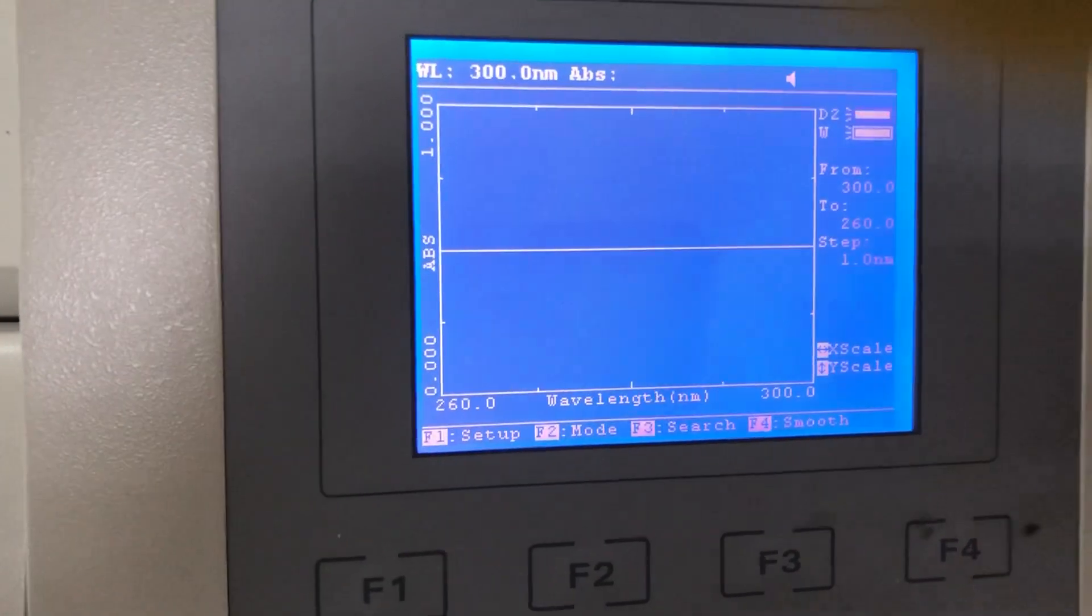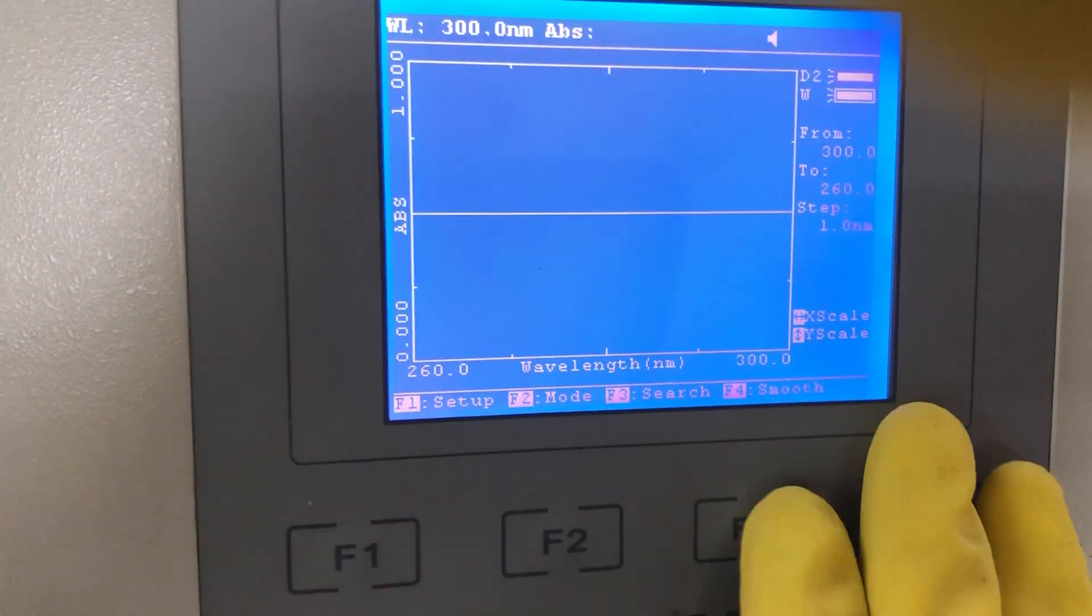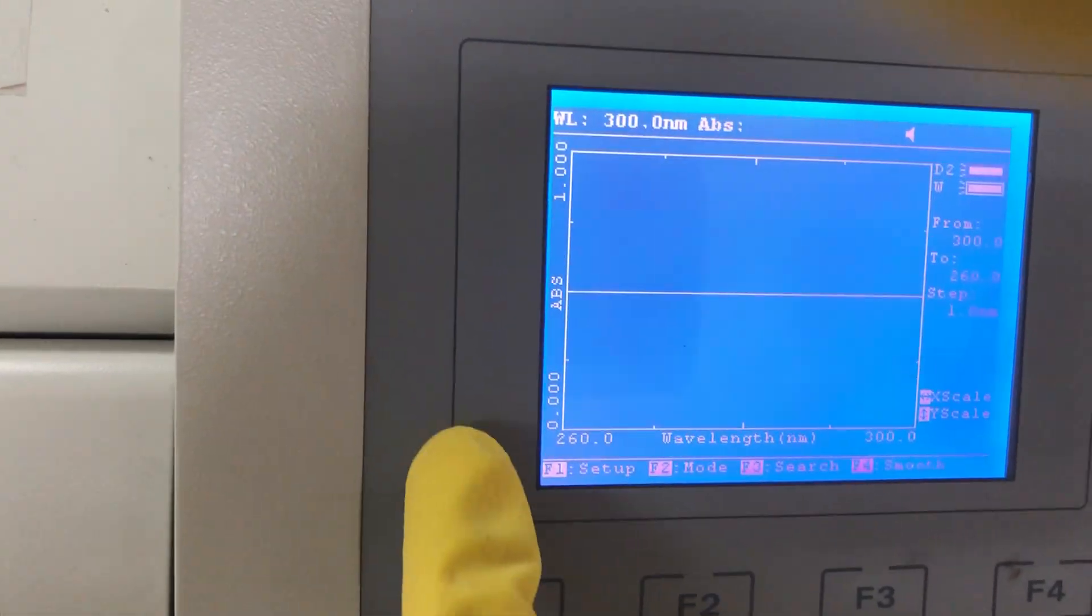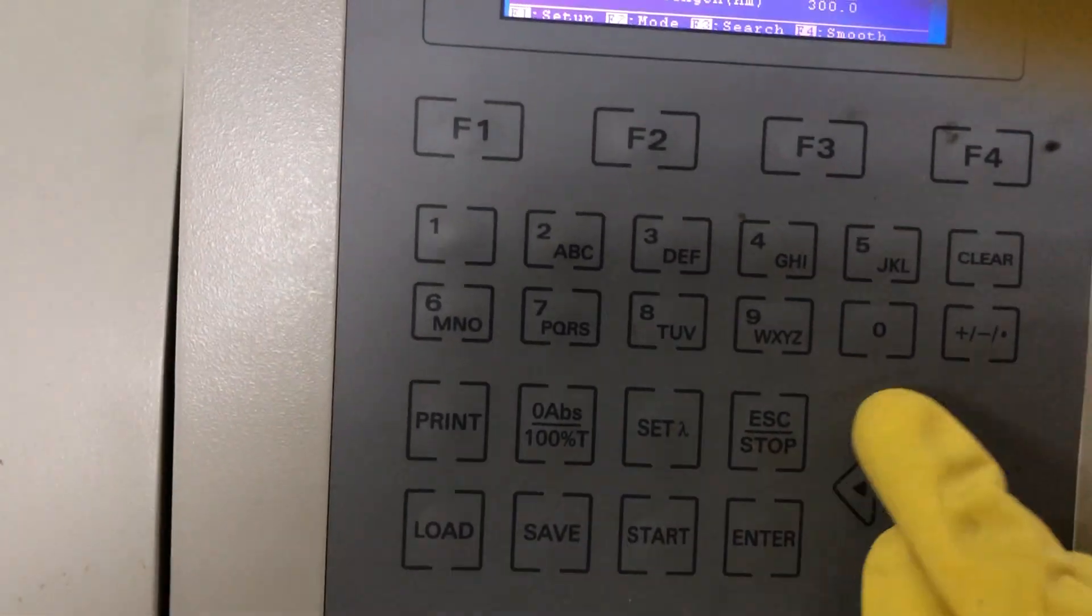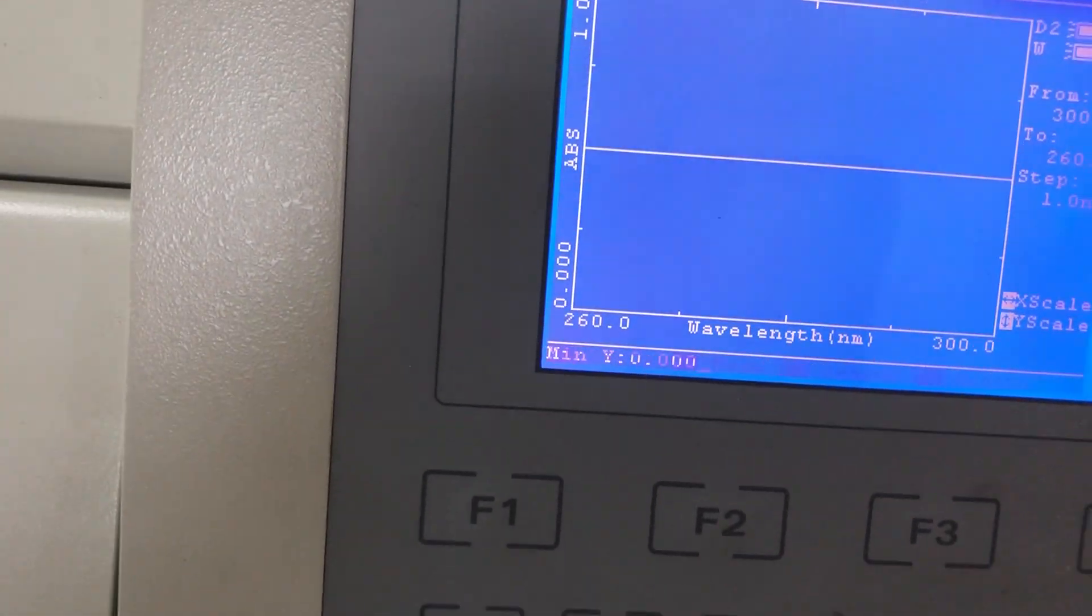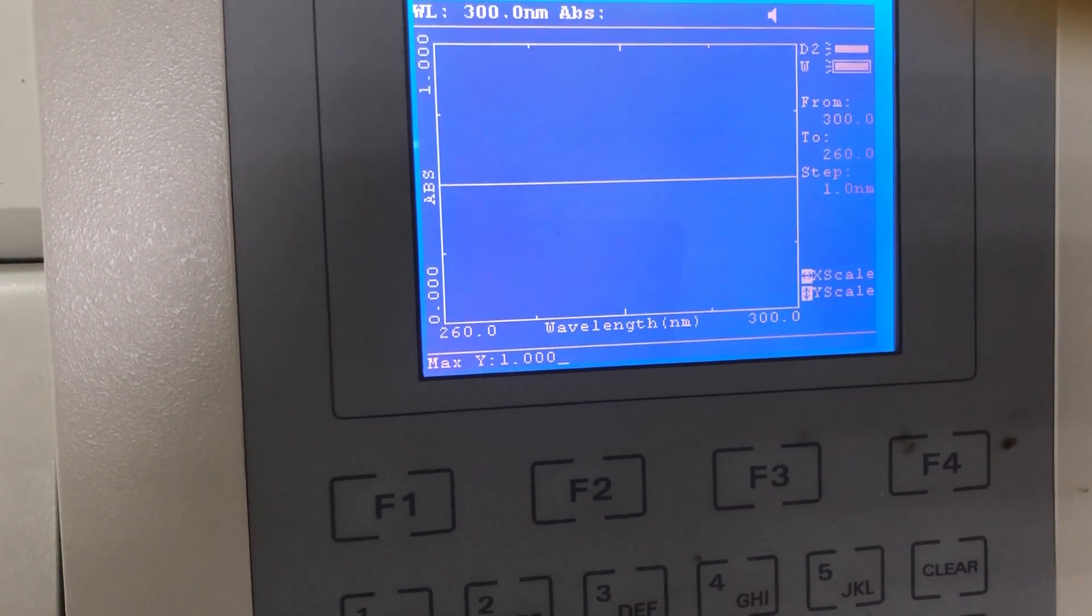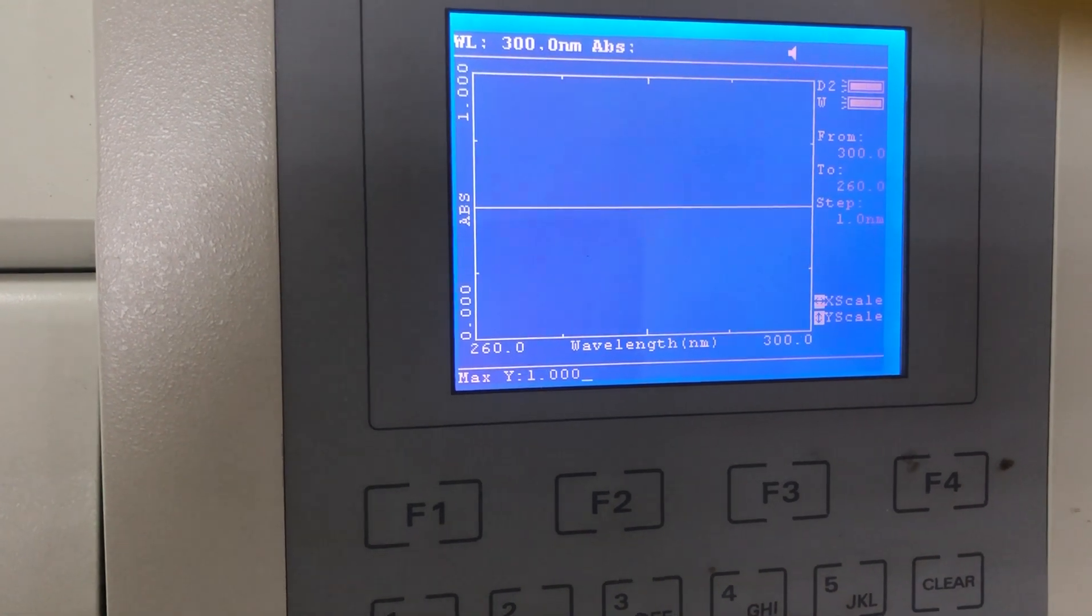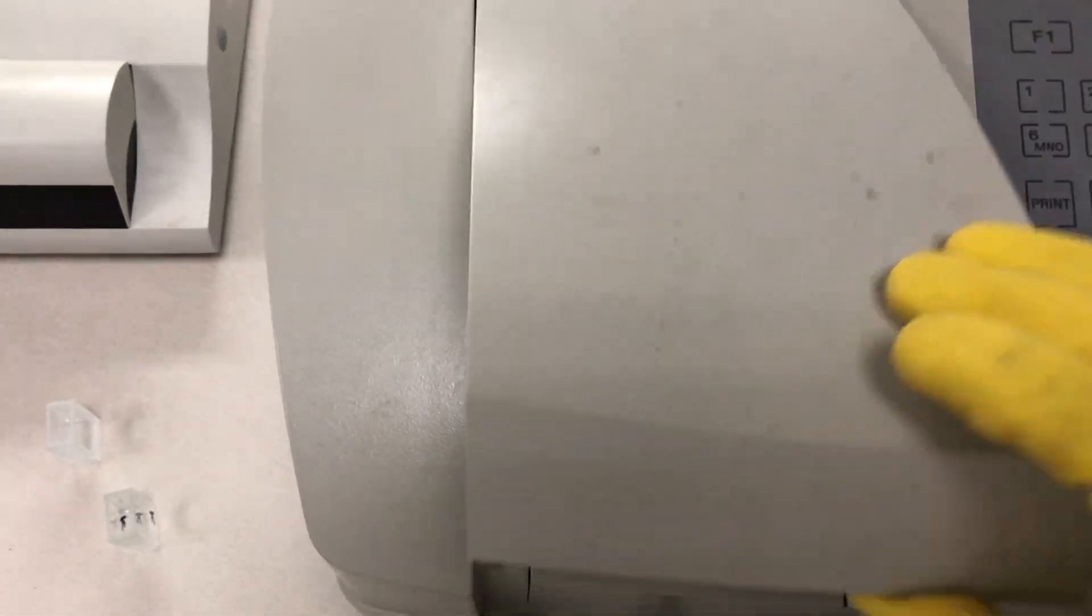You can here change the scale, X scale or Y scale. X scale is chosen by default from 300 to 260, and Y scale by default is 0 to 1. You can change it by pressing up and down. Minimum Y is 0, press enter. Maximum Y is 1, here you can change it to 3 by pressing 3, then enter. After that, you can close the lid.